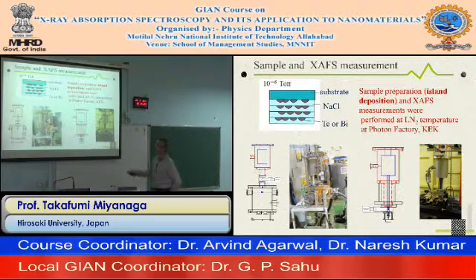So we set it very close to the beam lines, with a liquid nitrogen pump tank, and this is a vacuum deposition. First we deposit here, and after that, we move it to this holder on the beam line. And the X-ray is coming here. The sample is deposited on thin films.